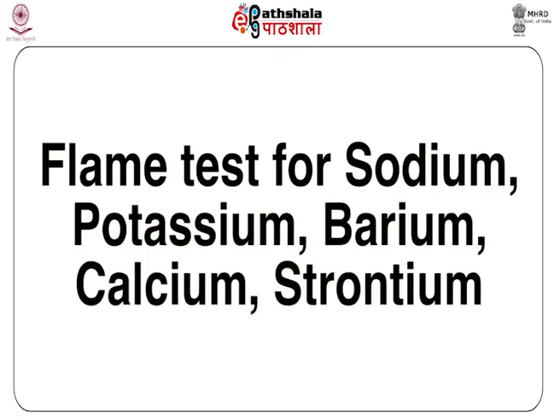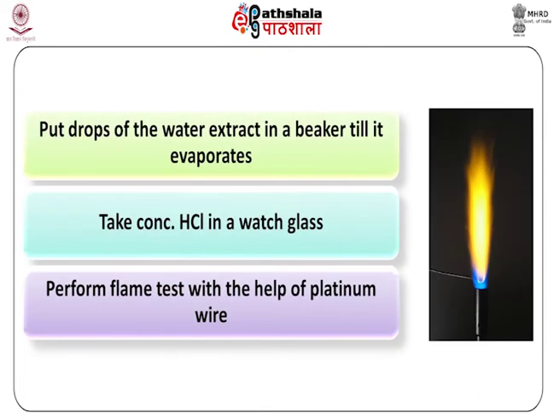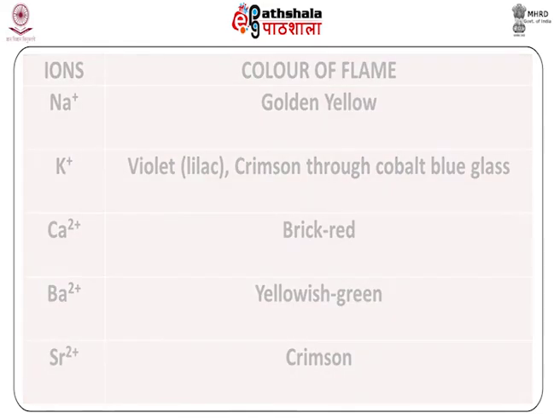Flame test for sodium, potassium, barium, calcium, and strontium. Put drops of the water extract in a beaker till it evaporates and is dry. After this step, cool it. Take concentrated HCl in a watch glass. Perform flame test with the help of platinum wire in the non-luminous flame of the burner. The response of various ions to the flame test is given.